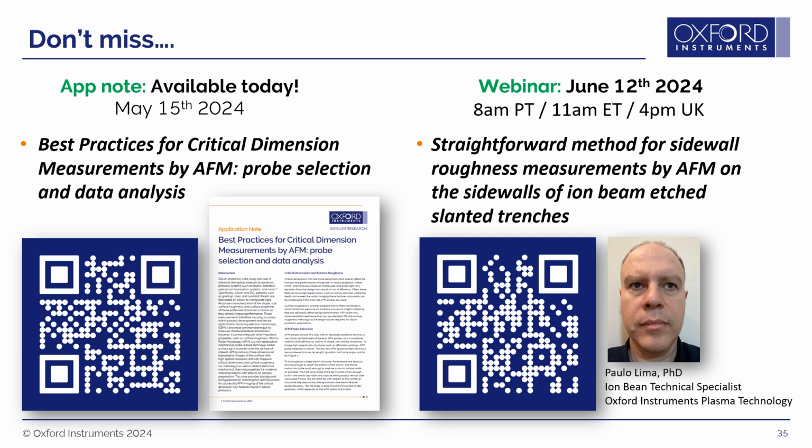Well, it really does come down to the tip that you're using. Different tips have different geometries. In some cases, like that one example I showed, the tip will be symmetric if you scan at 90 degrees. In other cases, if the tip is fully tilt compensated, then it'll also be symmetric from front to back. So it really does depend on the probe. And of course, ultimately it matters too what you're trying to measure.